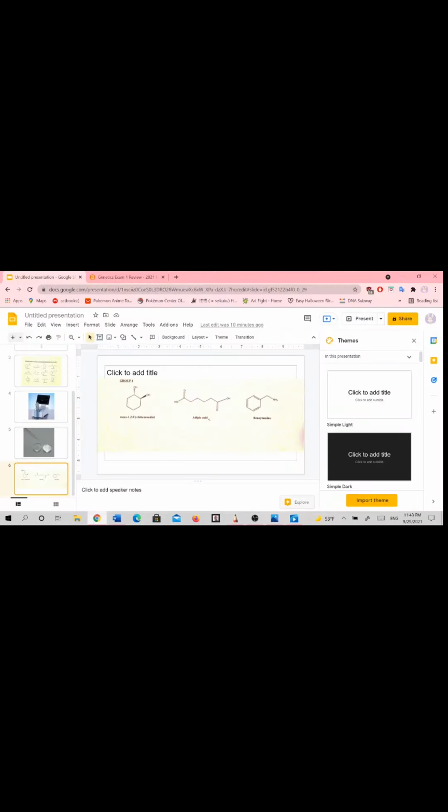So let's take a look at our IR spectroscopy graph here. Our compound could be one of these three compounds specifically. I'm going to tell you which one I think my graph lines up with and which ones it does not line up with.